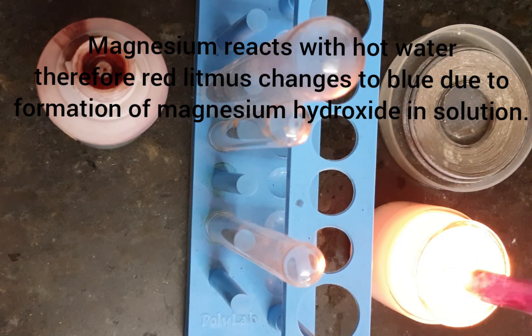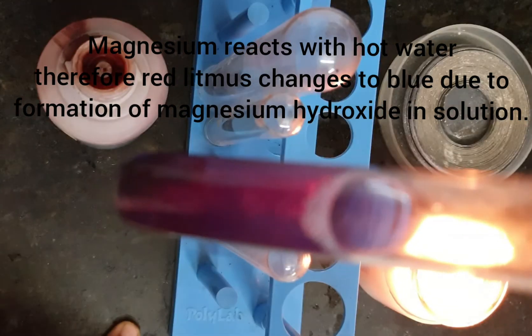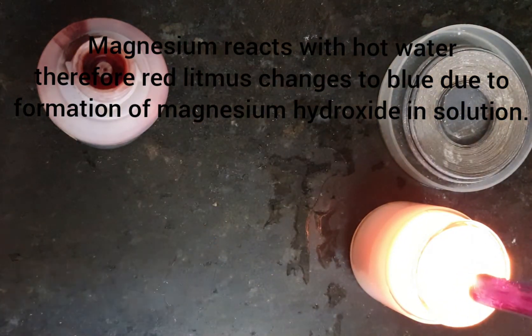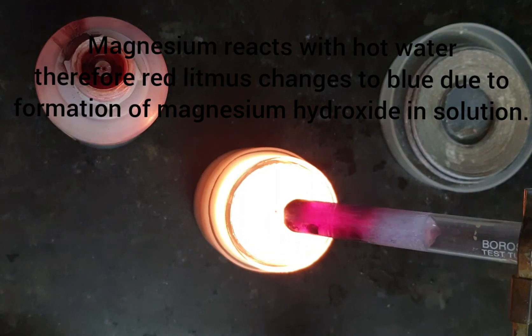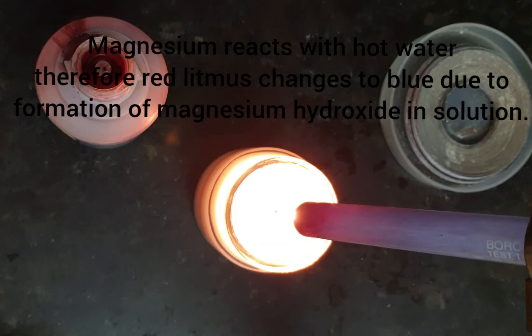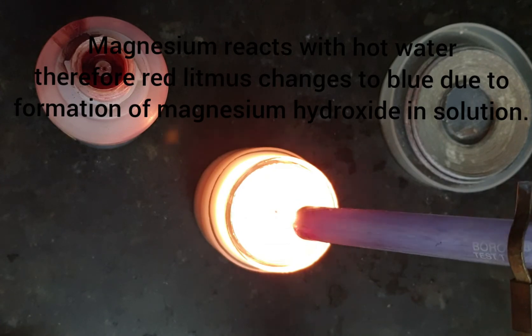See the bubbles above — they are turning blue slowly and slowly, so the red litmus is changing into blue. Now you can clearly see that the bubbles above are blue. The red litmus is slowly changing into blue, meaning the reaction is taking place between magnesium ribbon and hot water. It is changing into a basic solution — that is magnesium hydroxide.